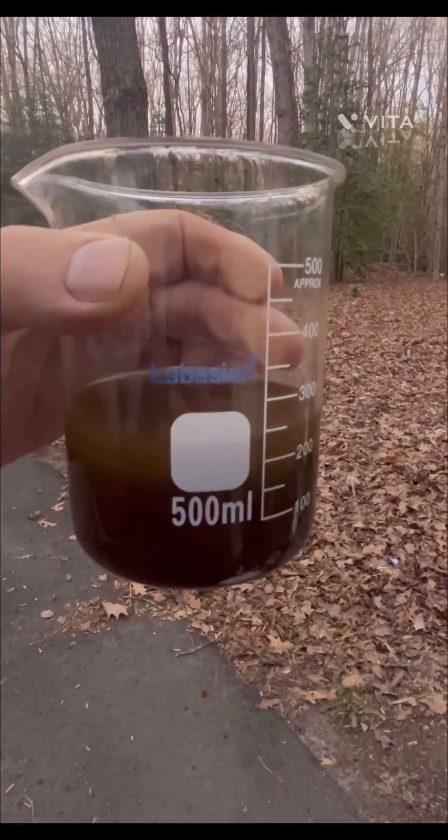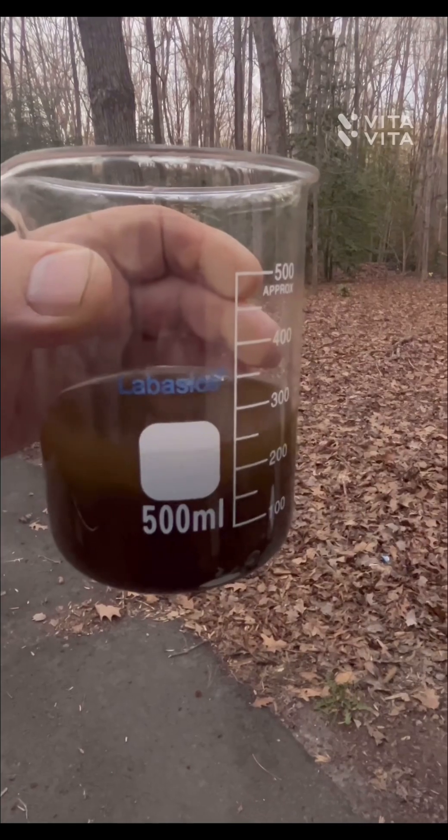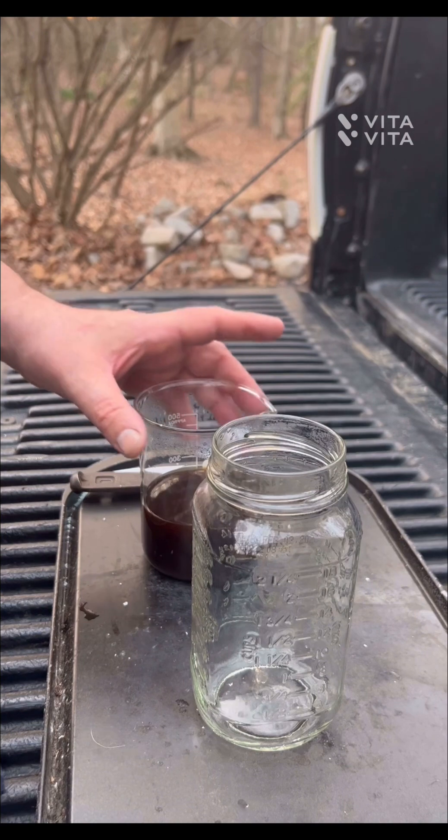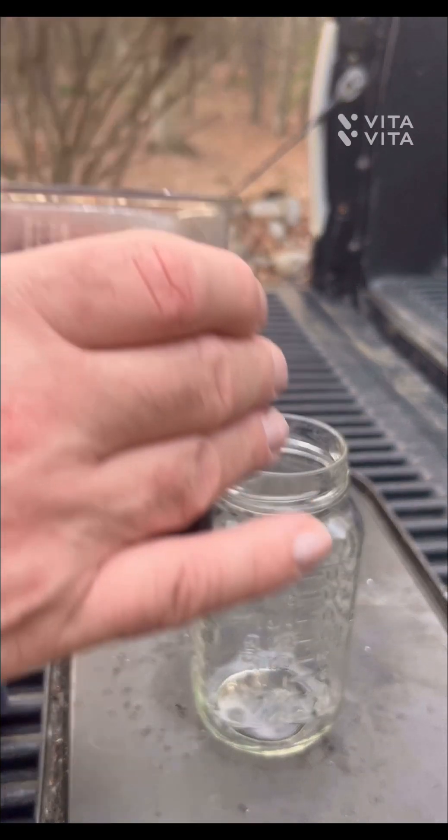That's dropping down real nice. We're going to heat it up, let it drop, and see what we have. It looks pretty good at the bottom — we're going to let it cook a little bit longer and settle out tonight. Got a little bit of that ferrous sulfate — drops it real nice.